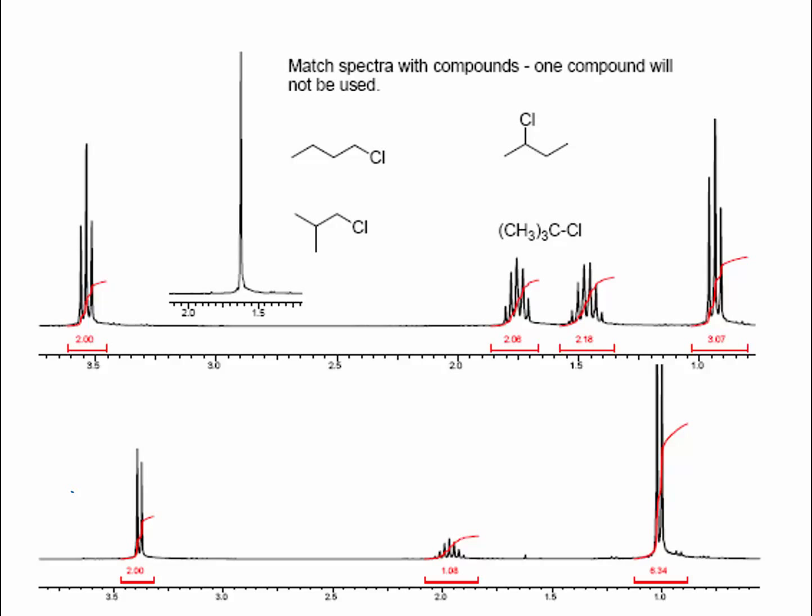All right, so let's look at what we expect here. All right, so in this one, we expect a triplet, quintet, sextet, and triplet.